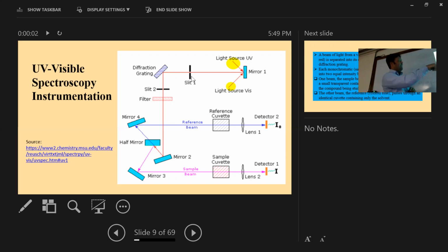We have several wavelengths, because a compound light, that means white light or visible light, comes through this slit and gets onto the grating. That time the light will separate into all its components.